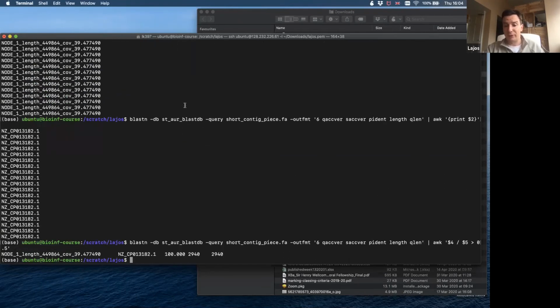The only thing you have to keep in mind, if you do protein BLAST, is that the substitution matrix is a very important thing. There are default substitution matrices. I think BLAST is probably using one of the BLOSUM matrices. Let's check if it's there.